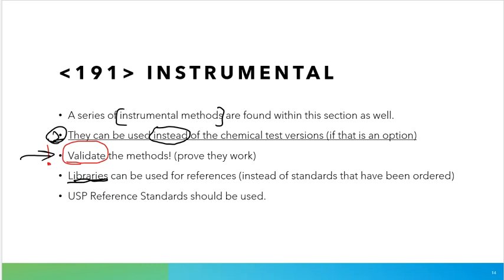It will say, listen, based on what this instrument sees and based on the data that was generated, we can match what's in our database, and we can say, yeah, this looks like this, and maybe a complete name shows up on the computer software, and it will identify what that thing is supposed to be. If so, that is perfectly fine. So those libraries are approved, and you want to make sure and double check everything when you do use them, just like everything else.